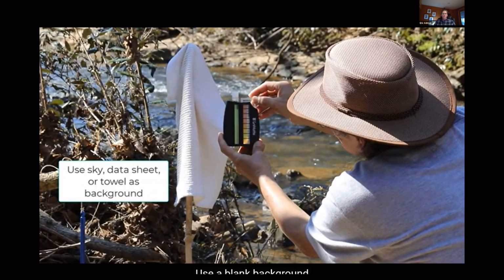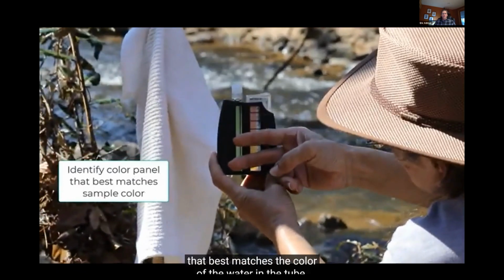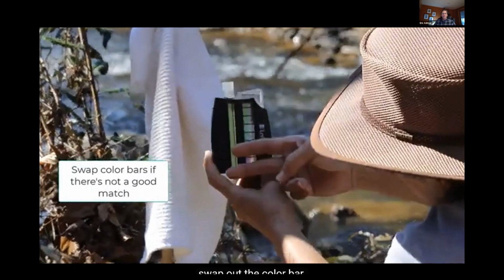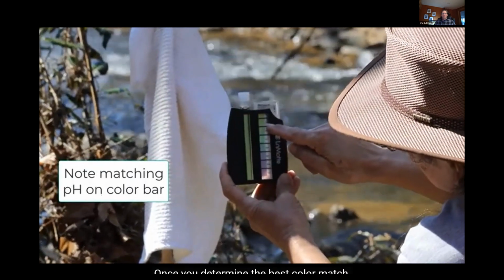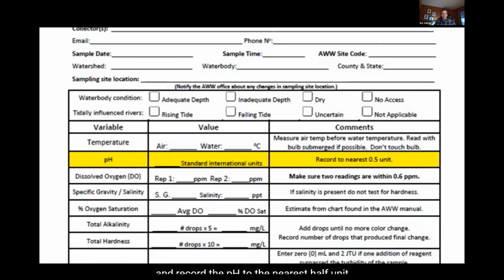Use a blank background like a clear patch of sky or the back of your data form, and position yourself so light is behind you so that you can clearly see the color. Identify the colored panel on the color bar that best matches the color of the water in the tube. If there doesn't seem to be a good match, swap out the color bar. Once you determine the best color match, note the pH value represented on the color bar and record the pH to the nearest half unit on your data form.